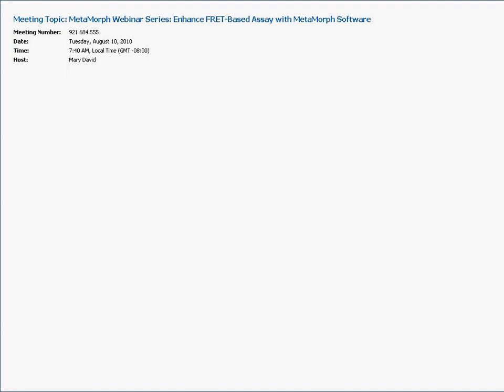There's a question earlier from Guillermo about whether there is a way that, upon setting the regions, MetaMorph can automatically calculate the constants. No. Right now we don't have that built into the dialog, so there's really no way of doing the auto calculations for the constant.